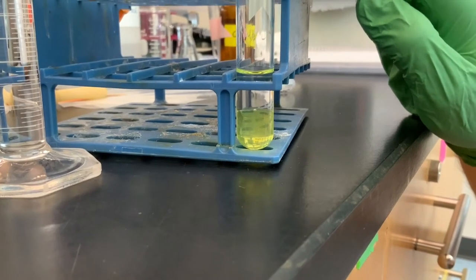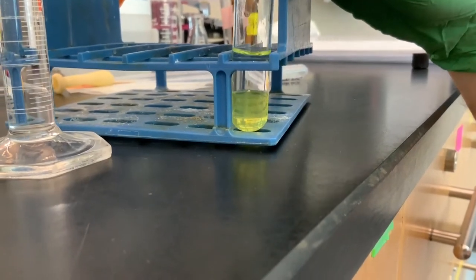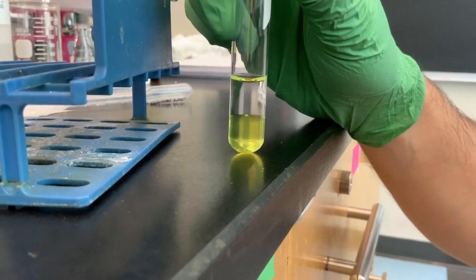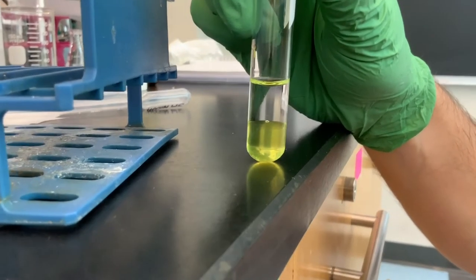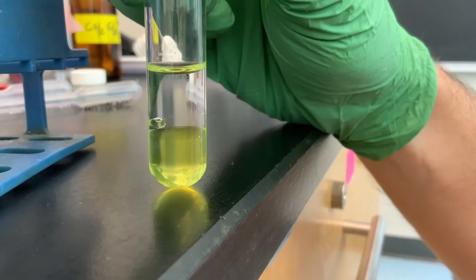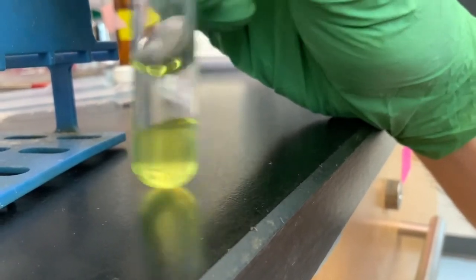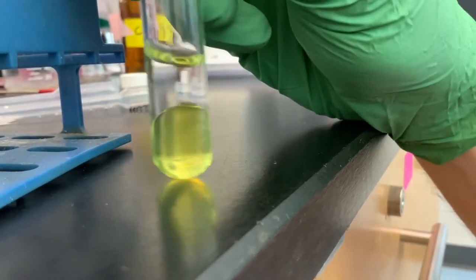And you can also see it when you're heating something. But anyhow, it's nice to look at and be aware of. Schlieren is partially responsible for what someone might see as a mirage in the desert and might think that it's a pool of water, but it's not. Can the camera see that? Sort of. I think what's more impressive is that little bubble of methylene chloride trying to decide whether or not it should go to the top or the bottom layer, because a little bit of it hangs out up top, which is frustrating.